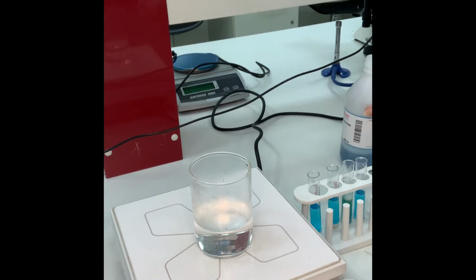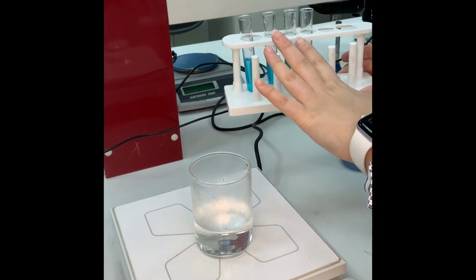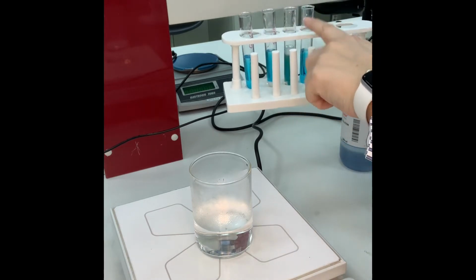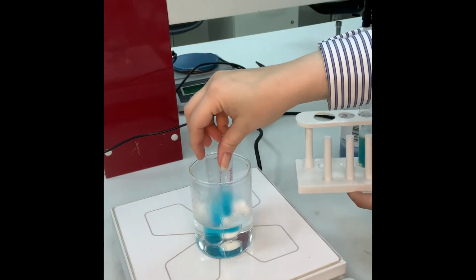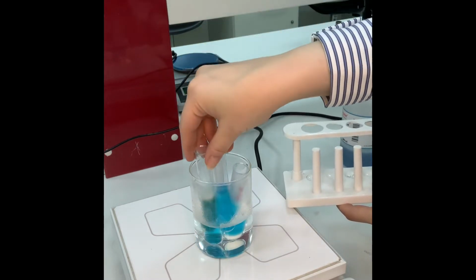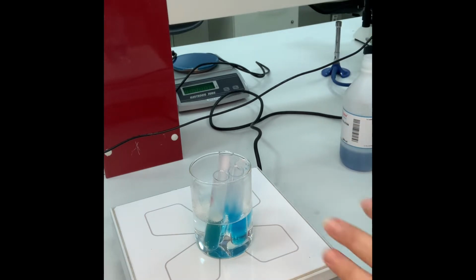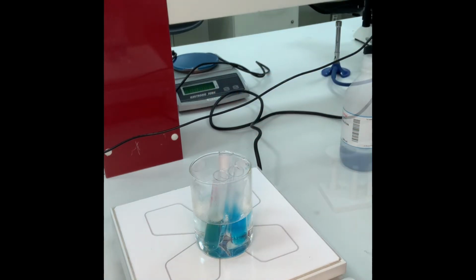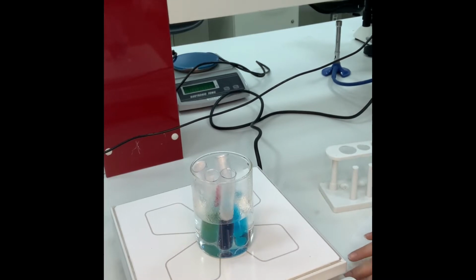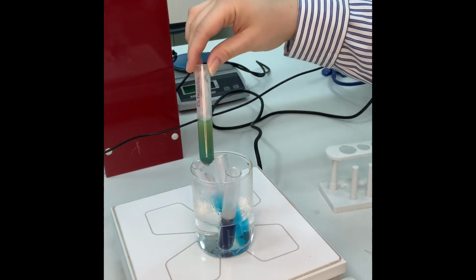Now, why do I have to add Benedict to all 3 of them? I need to know for sure that starch or egg white doesn't contain sugar. So Benedict reagent is made to test for the percents of sugar. I will keep it for let's say 5 to 7 minutes and I will come back for the result. I just need you to see the start, how it starts to change in color.